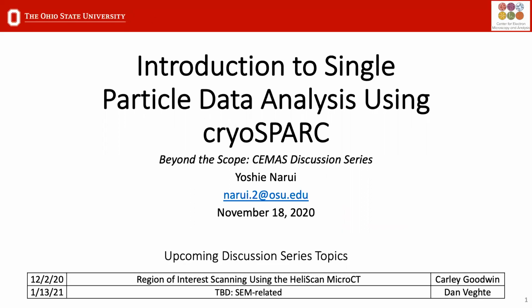And then the volume, so this is actually where you put in your ab initio model. So your low res model you have here, right? And you want to actually deposit it here, so that gives it a starting point to do the refinement. And then, as I mentioned before, if you know something about the symmetry, you can insert it here. I believe the proteasome's D7 symmetry, so you would put D7 here. And then you can adjust all the other parameters as you see fit, and then you would run this job.